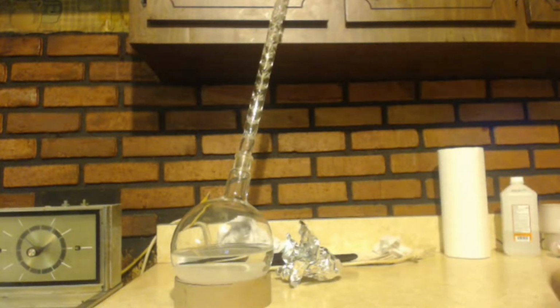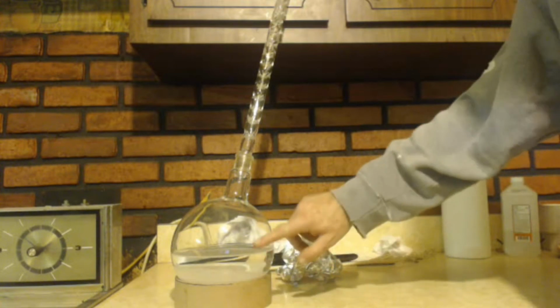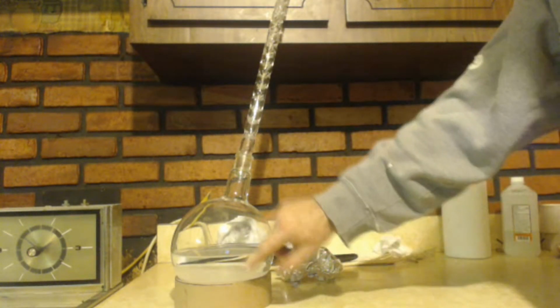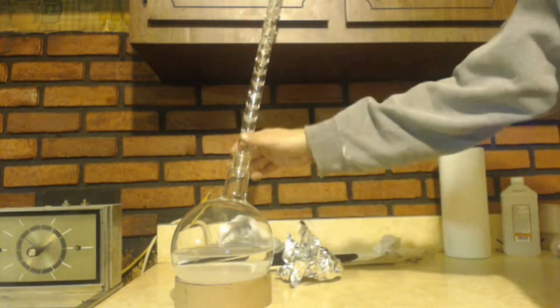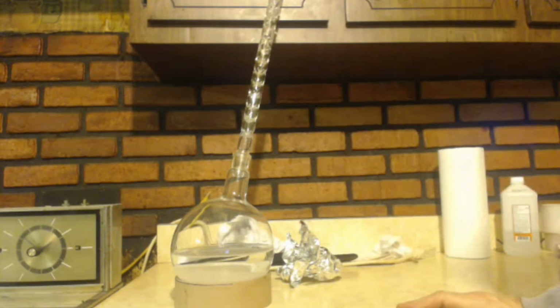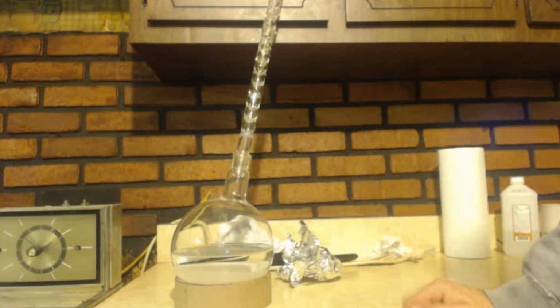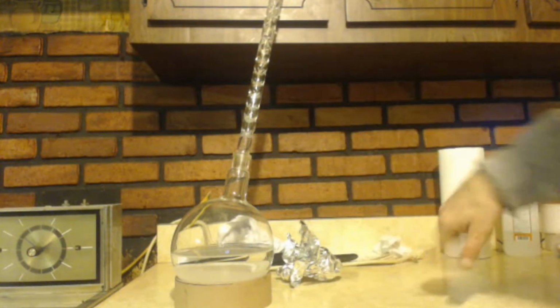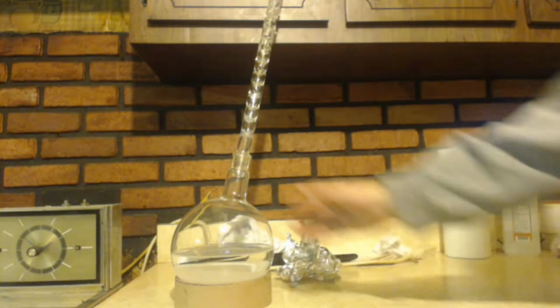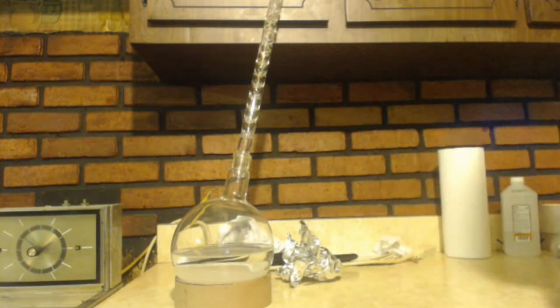Now, because I did add that extra sulfuric acid in, this was the pot. You can see it's still got some of the stuff in it, precipitated out when it cooled down to room temperature now. This I used because I figured I wanted better separation with the nitric acid, having that much extra sulfuric acid in there. If you notice in my video on how to make red fuming nitric acid, I don't use a Vigreux. I just whatever, because it's all mostly nitric acid. But I use the Vigreux column here, so keep that in mind.